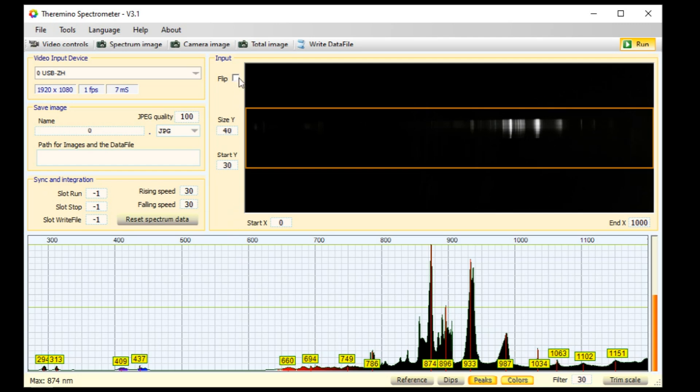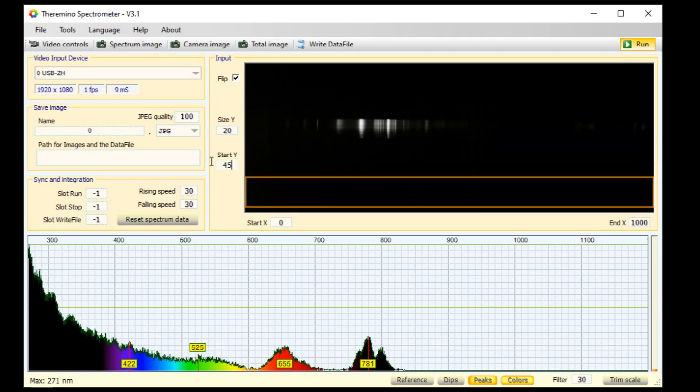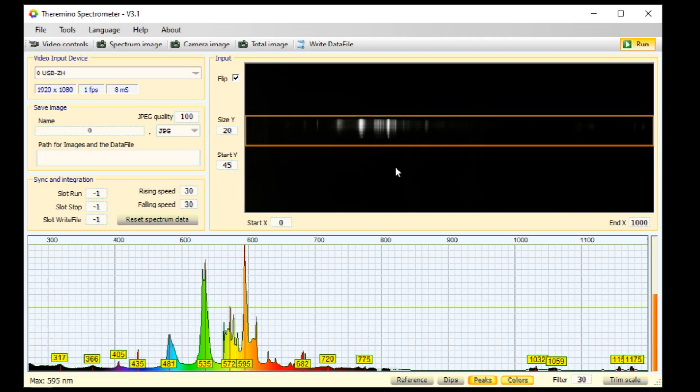Click the 'Flip' checkbox — you should now have flip checked. The run button should be yellow and there should be some spectrum lines visible. You might want to size the orange box vertically closer to the image, but it doesn't matter much as long as the image data is inside the orange box. Don't bother with the horizontal position, as we will be constantly changing that as we zoom in and out.